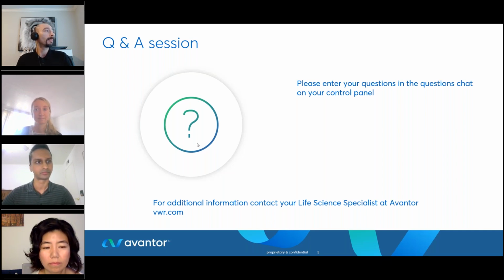Thank you. Aaron, maybe you can support with this question as well. What is the maximum size of plasmid that you can sequence? What will happen if the plasmid is too large? Yeah. So we do have some community members that are sequencing very large BACs, for instance, near the 200 kb range, as well as publications that report successful assembly of BACs.